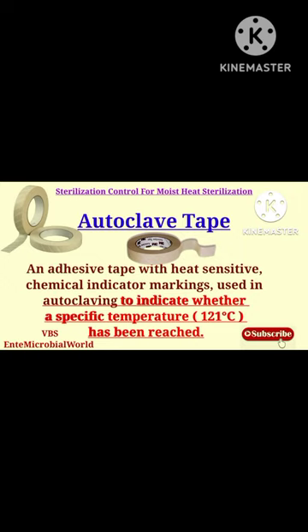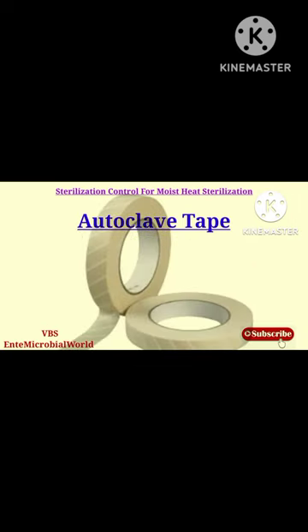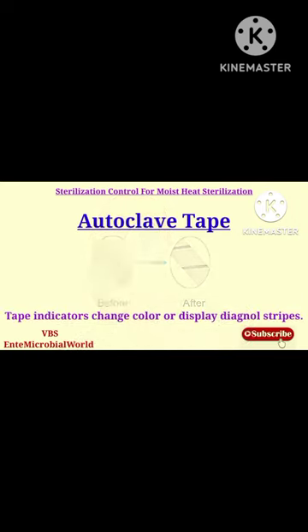When the temperature of 121 degrees Celsius has been achieved within the autoclave, tape indicators change color or display diagonal stripes.